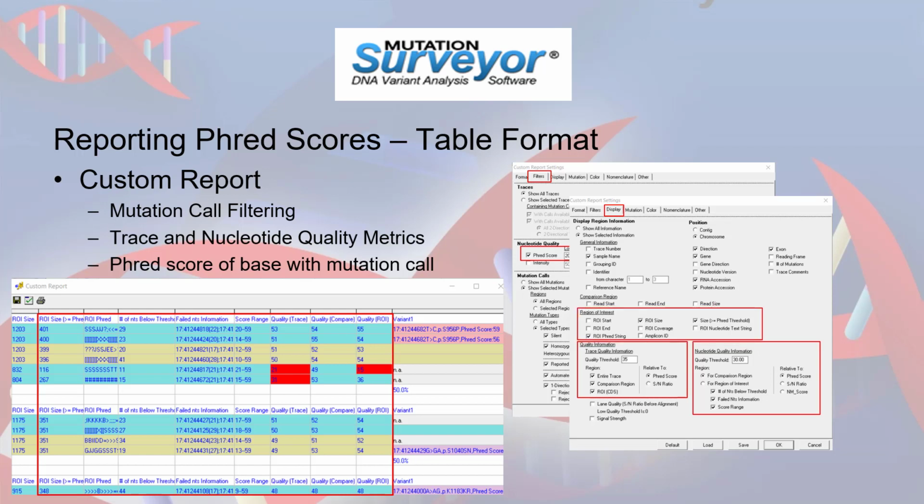Below the Region of Interest section is the Quality Information section that can provide trace quality information based on a Phred score threshold for selected trace regions. When the average Phred score for the selected region is below the threshold, the report will flag this value for the sample trace file with a red background.